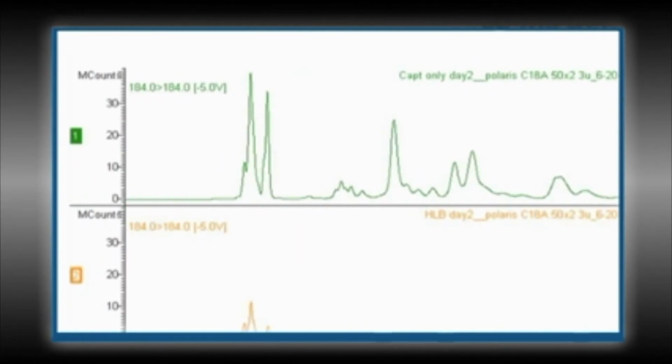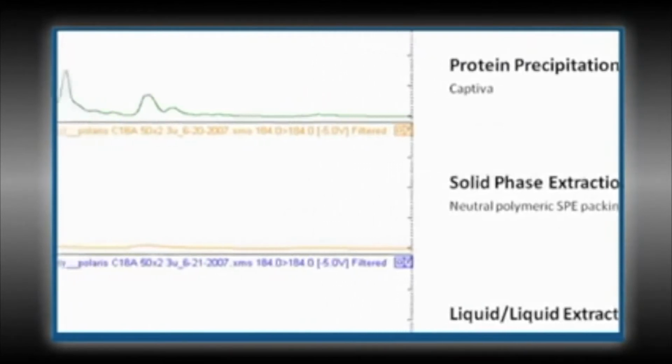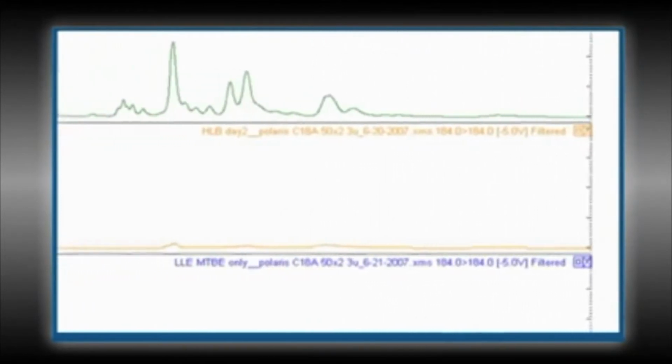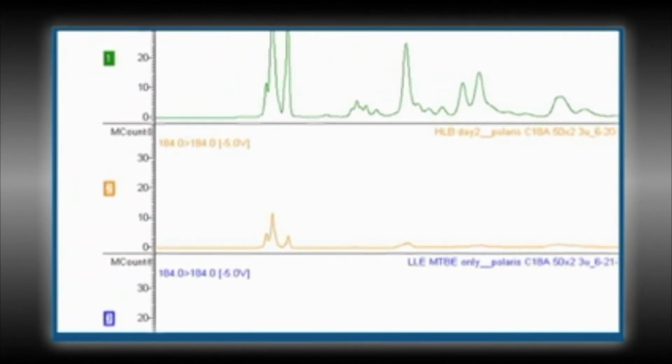These lipids will stick on the column for up to 50 column volumes and build up in the system to cause clogs. This can also contaminate the mass spec. See in orange below it the profile of SPE, which is a more time-consuming and expensive sample prep method that may be overkill for this analysis.